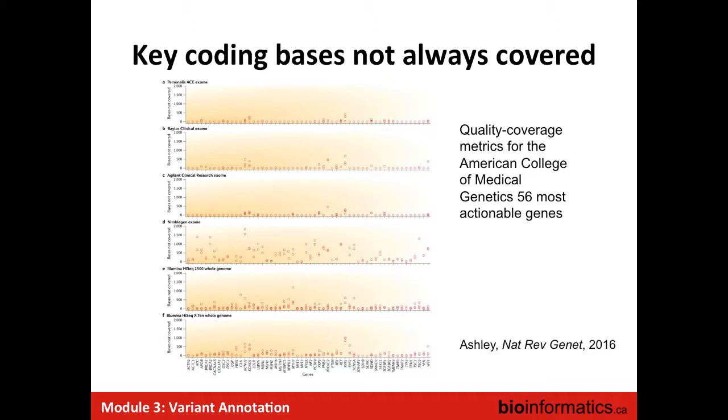For cancer, which is more complicated, the tools are more complicated, so it's a few weeks to run the full pipeline. But in one project we analyzed a general tumor in 3 days, by making some trade-offs to focus on specific regions. Usually it's one or two weeks for whole genomes. Then you have to add priority on the cluster. If your cluster is overloaded, you cannot get it running for days. It is a limitation of whole genome sequencing.